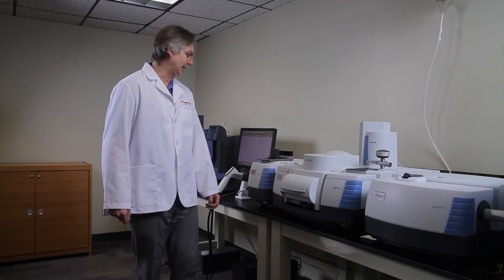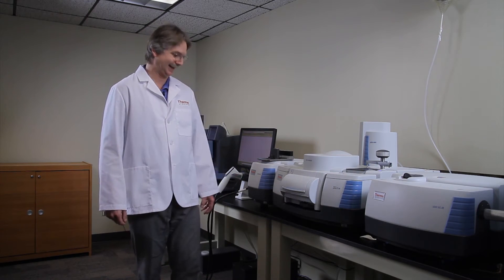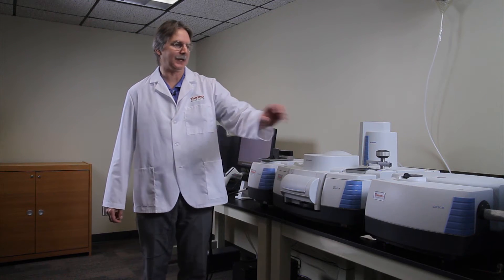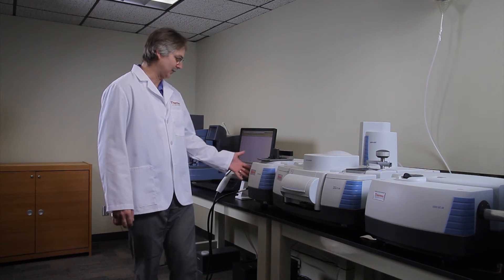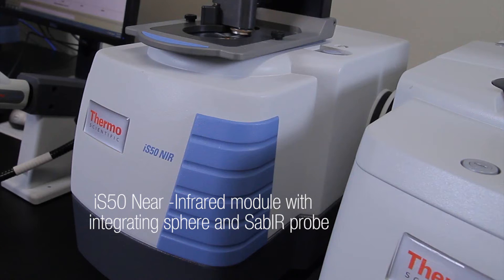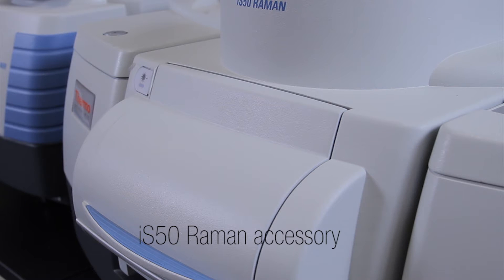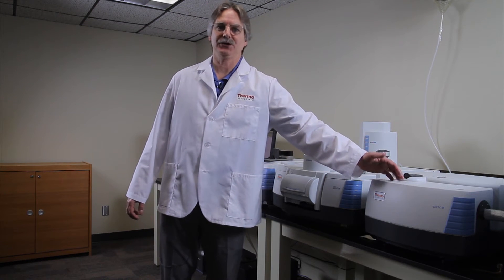Let me introduce the instrument to you. It is an FTIR spectrometer, but we have several components that can be attached to increase its use. For example, we have a near-infrared module that includes an integrating sphere and a fiber optic probe. We also have a Raman accessory in the accessory compartment, and we have a GC instrument attached to it for further analysis.